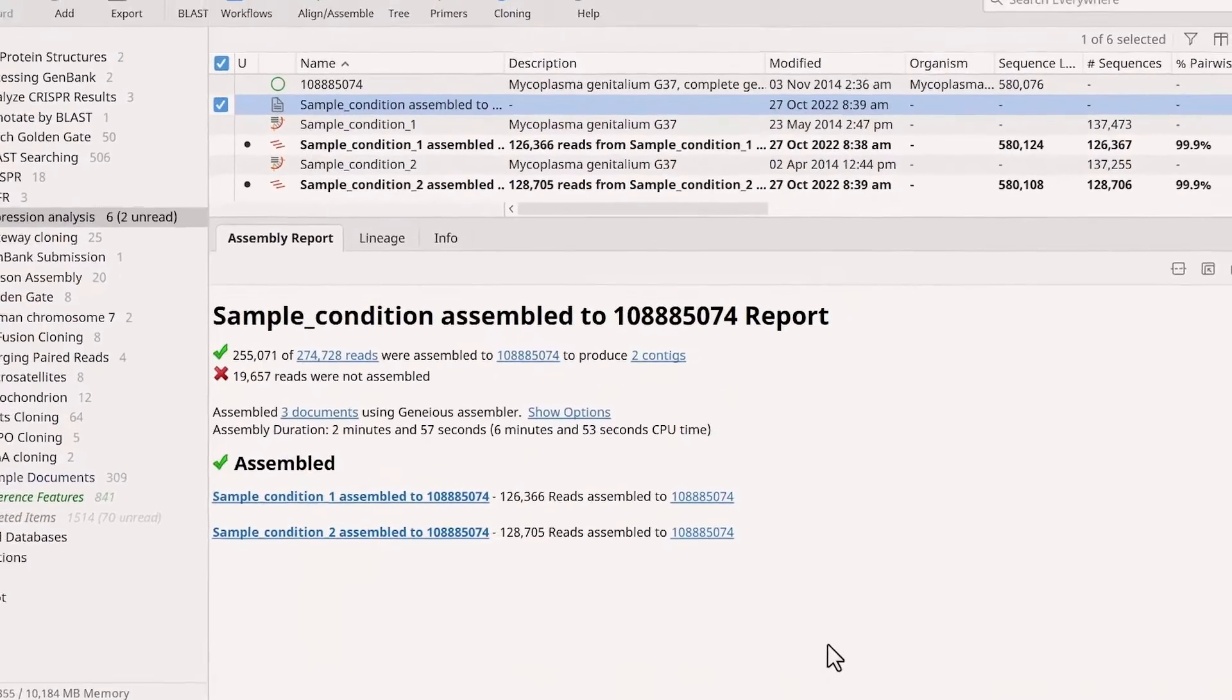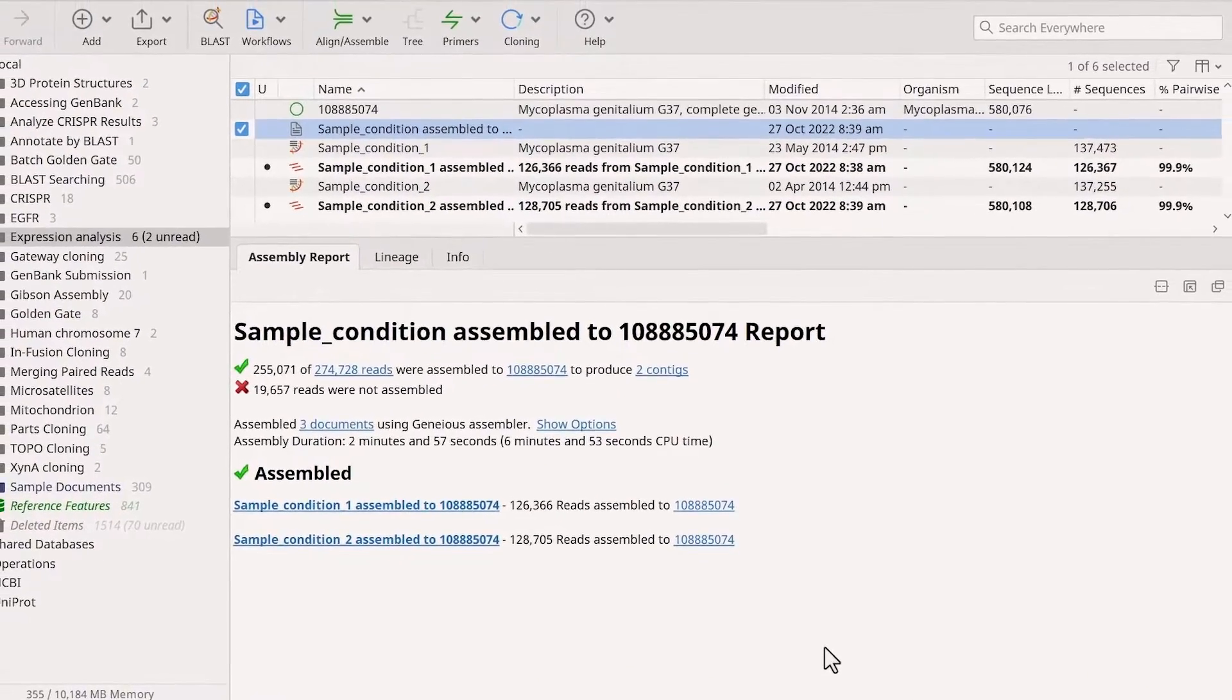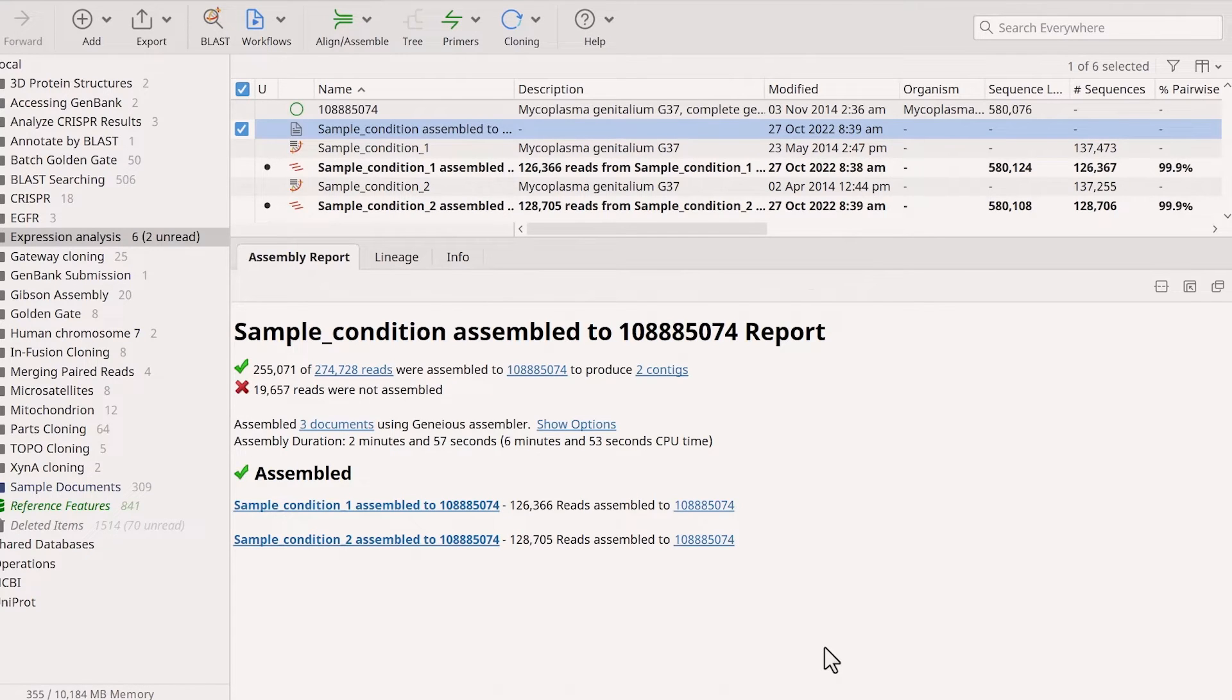The result is an assembly report summarizing the mapping and individual assembly files.